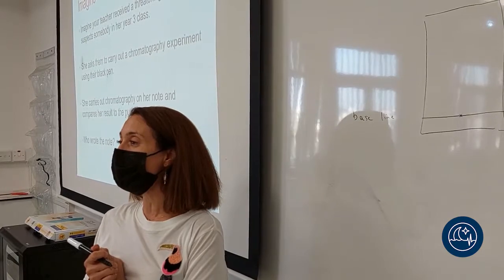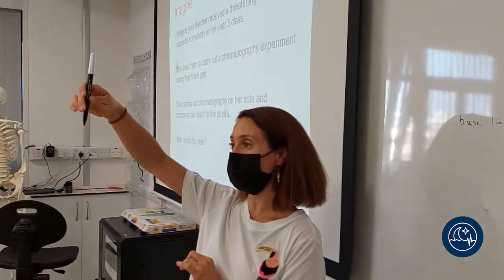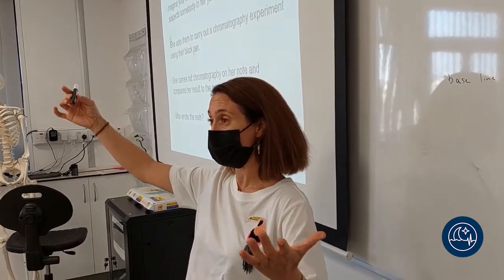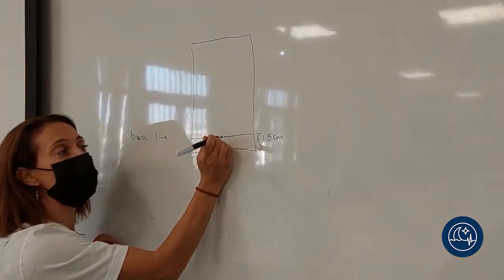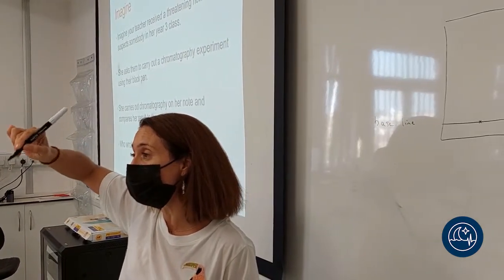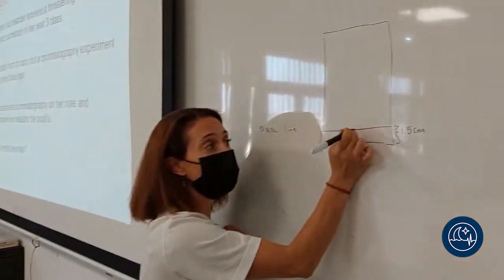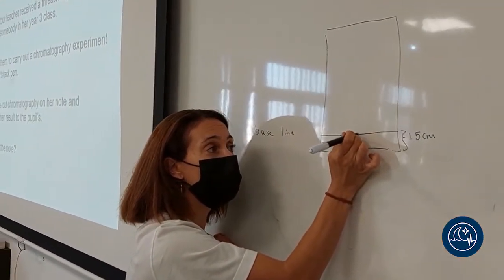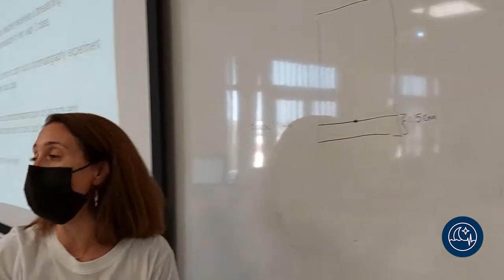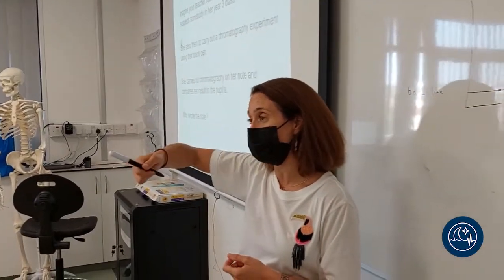Listen to instructions. Now you can use your black pen, which is my evidence, and you're going to basically just tap, you're not going to scratch off the silica on your chromatography paper, you're just going to tap, and you should get like a little circle. You should tap with your pen onto your cross. Okay? You've drawn a little line. Do you want another paper, Nikita? Okay.